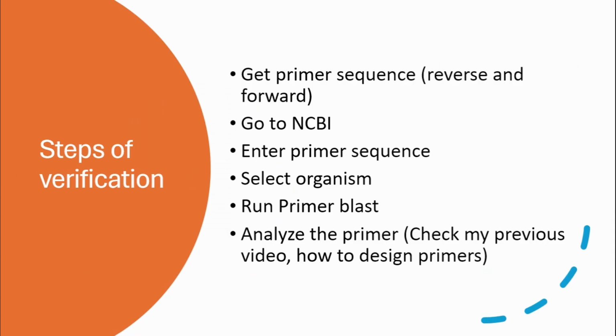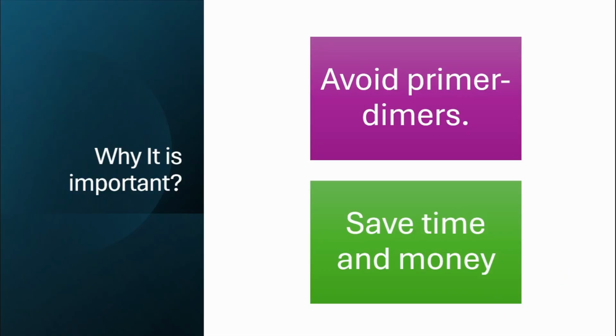So this is how you need to verify a primer from published articles. Why it is important: there are various reasons, but the main two are to avoid primer dimers, and to save time and money. Thank you.